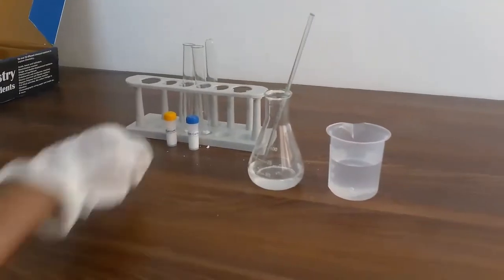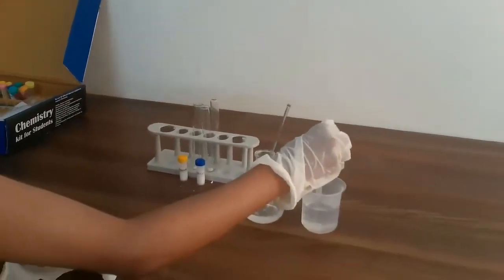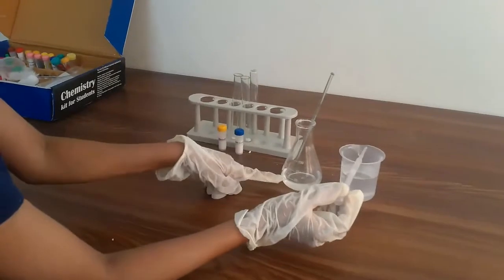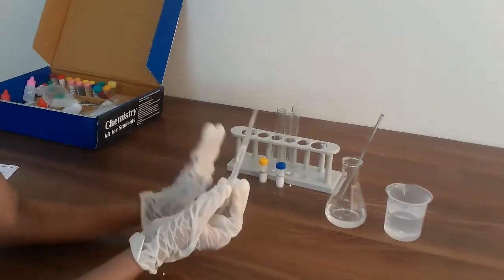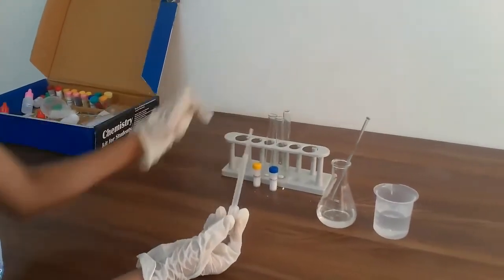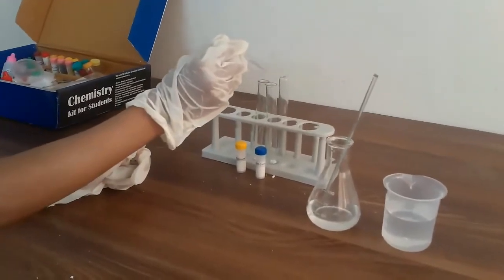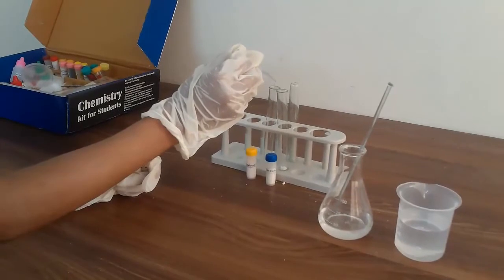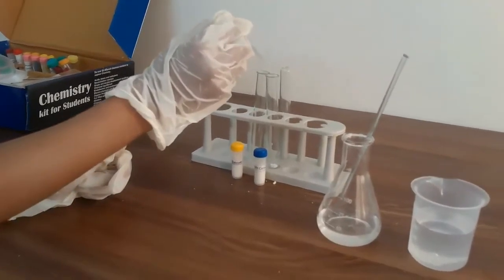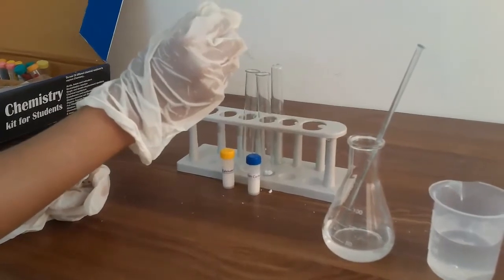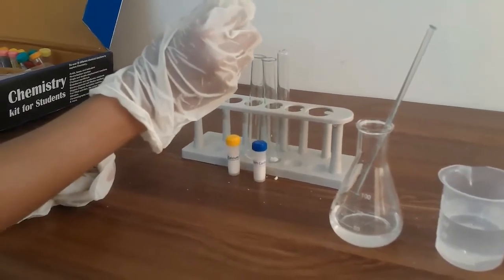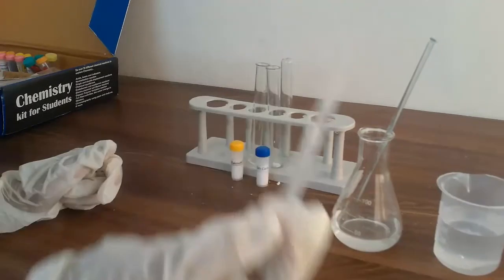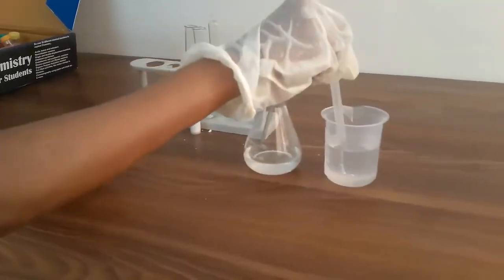Now the next step is to take your pasteur pipette and take some water from inside it. Take the clean water, not the water from which you just washed your spatula. And pour 25 drops of water inside the first test tube.